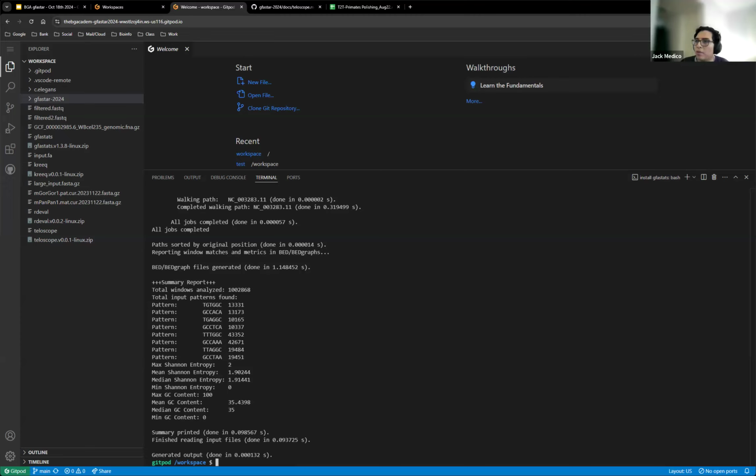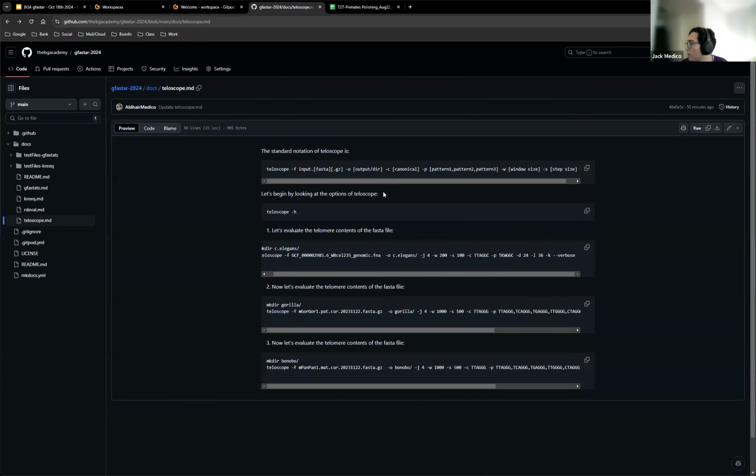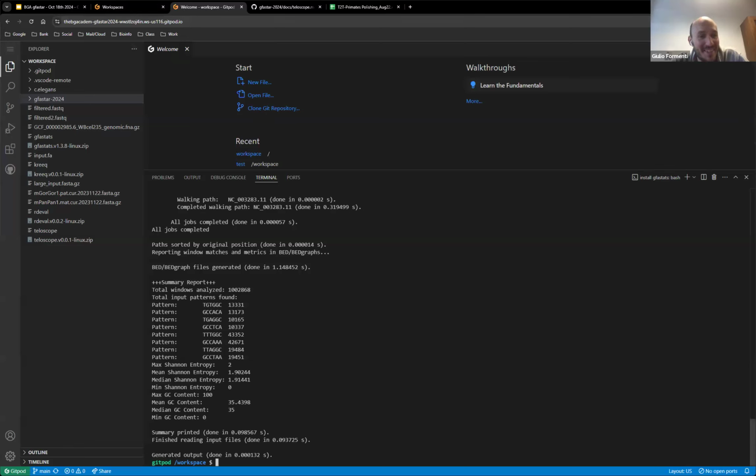Okay, I don't know if everyone is following me up until now. If not, please let me know. Otherwise, I can finally continue. I downloaded the Gorilla. Oh no. That's okay. Next time I will probably just use one.